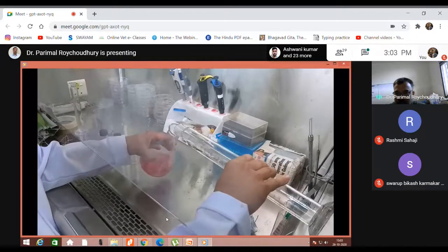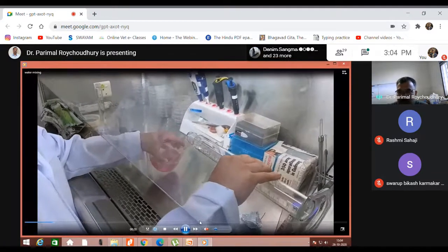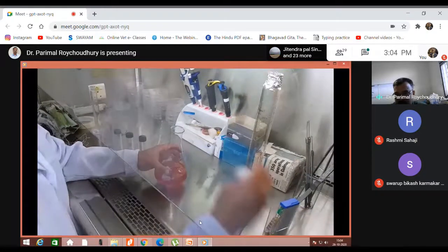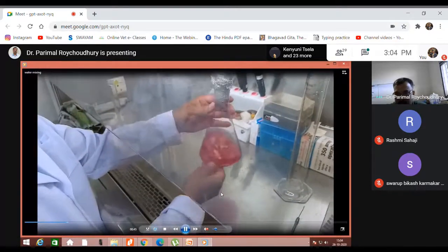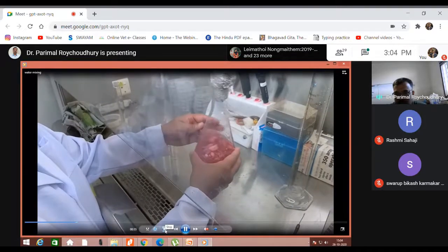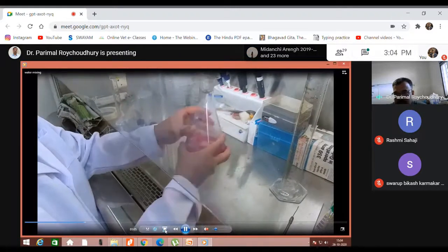Once this media is dissolved into the water, we need to check the pH with the help of pH paper. All the media have a definite, adjusted pH. So as per the company's recommendation, when you measure it properly, you will obviously get the same pH. So we allow it to dissolve. Then we will check the pH of the media. You are supposed to do all these things in your practical. Once you return, we'll do all these things and the demonstration will be given to you.